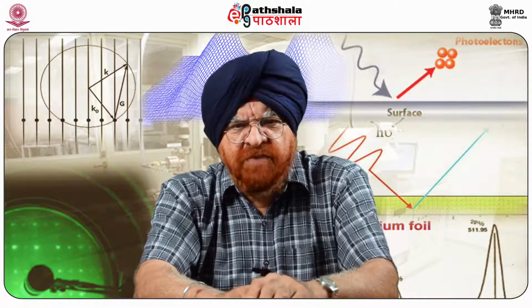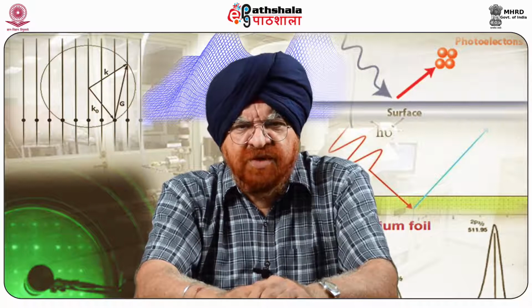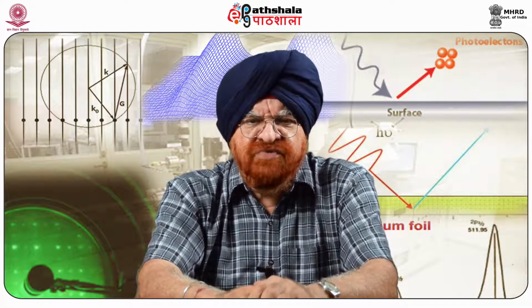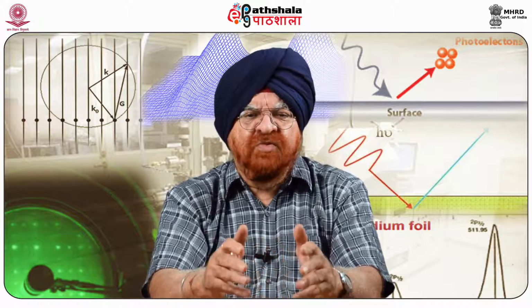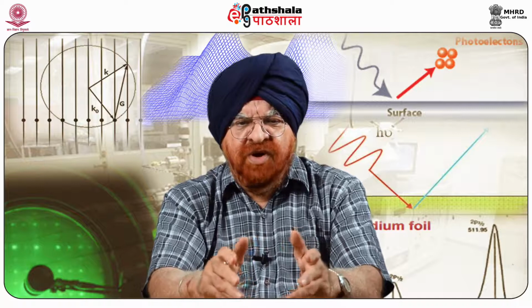We come to the ambient measurements in liquids. Capillary force is a major problem in tensile force measurements since it effectively strengthens the tip surface interactions. It is usually caused by adsorbed moisture on substrates from the ambient environment.